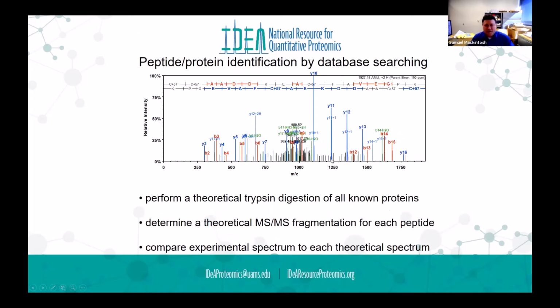Now, of course, to identify 10,000 proteins in a cell lysate with just a few hours of mass spec time, this has all got to be automated, because we're talking about tens of thousands of spectra being generated per hour of instrument time. And there are other problems with data analysis involving the presence of noise and non-ideal fragmentation patterns and things like that.